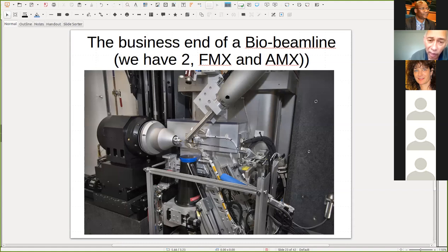So one thing that helps is you've got this cooling thing. It sends gaseous nitrogen, LN2, 77 K, let's say, actually they run it at 100K. This thing heats it up a little bit, it's 100K. And then this big thing down here is the camera, which we'll actually see an image that came from that camera. And then the beam comes through this little hole here. And then what we can't see is the detector. So let's go to the next picture.